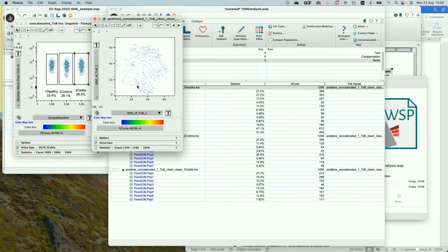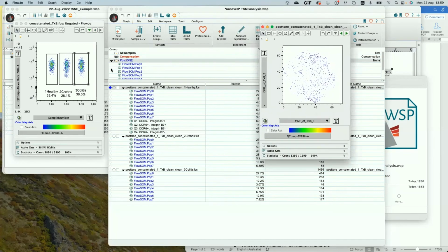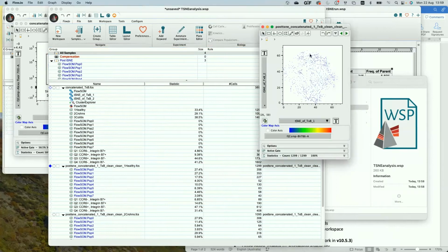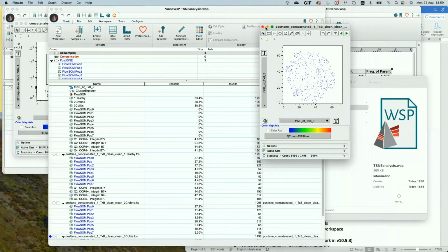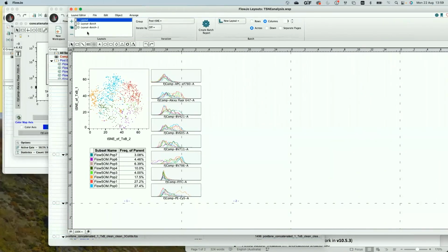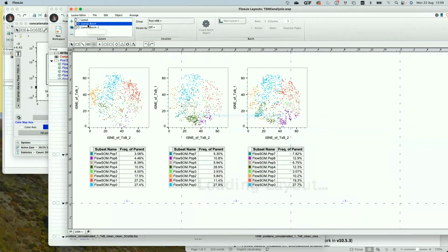things on the label, the tSNE axes. So by doing the tSNE analysis first or your clustering analysis first, and then exporting, all of that tSNE analysis gets linked to your individual samples. And now you can actually start having a look at what's different between your populations. So when you come into your layout editor here, I've dragged and dropped on the overlay here my clustered populations.